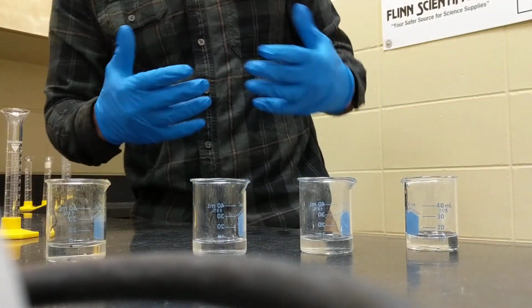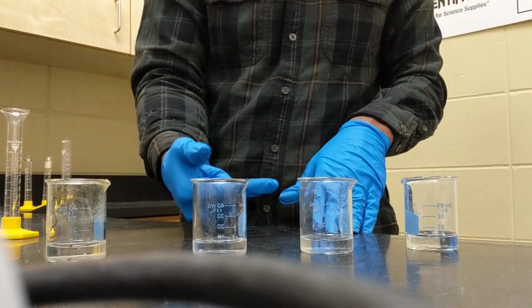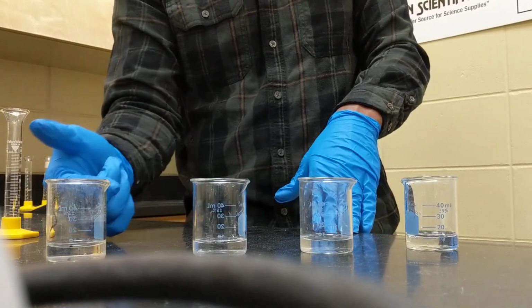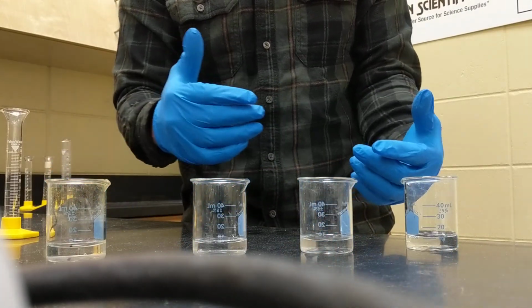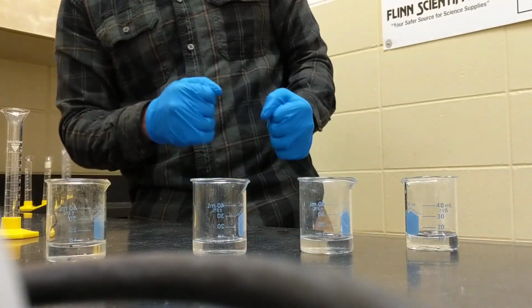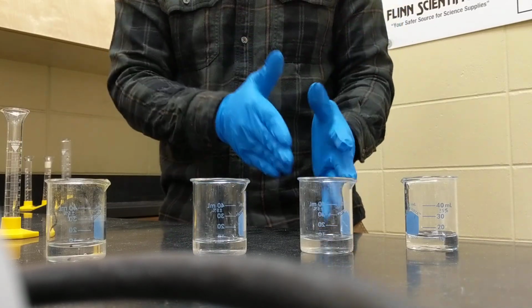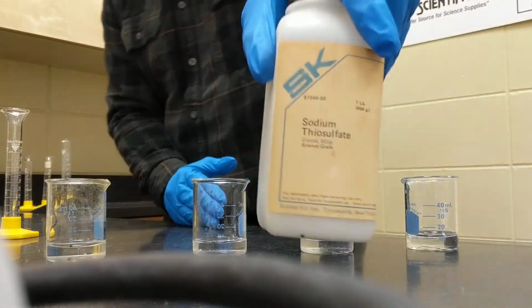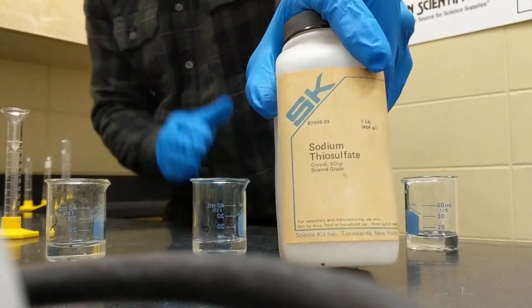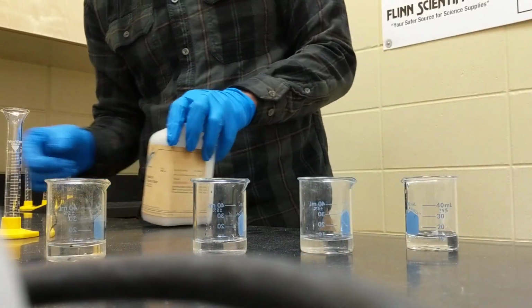Now, if you really want to expand your exploration of this lab, you can actually measure the Tyndall effect, something we've discussed before, where it's basically the turbidity or the cloudiness of a solution. But since we're focusing solely on the chemical kinetics, we're going to measure the change in concentration of this sodium thiosulfate as a function of time. So here's what we've done.